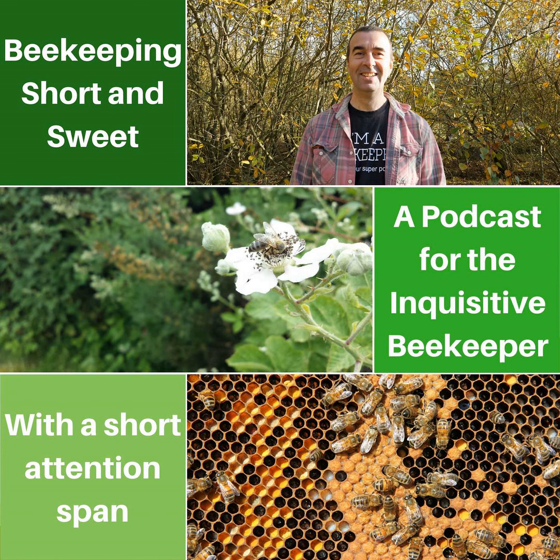Great. So, as Alan has just said, it's really easy to get involved in microscopy for beekeepers, to take a look at the pollen, to maybe have a look for nosema, start some honeybee dissections. And from my perspective, I think it's an area of beekeeping that not enough beekeepers get involved in, yet it's so fascinating. I certainly would like to encourage everybody to at least take a look at it and maybe pop something on your Christmas wish list for this year.